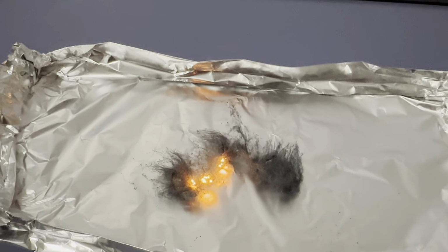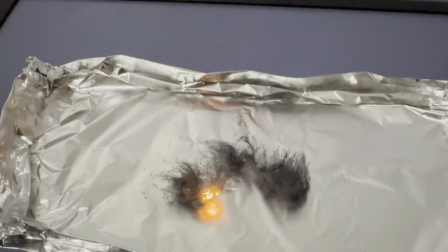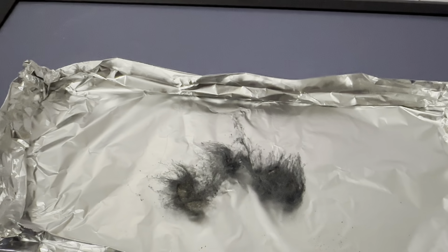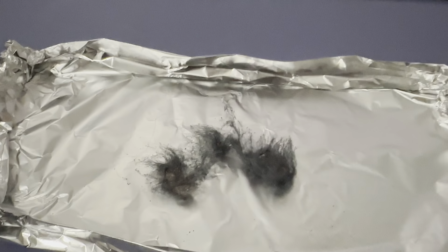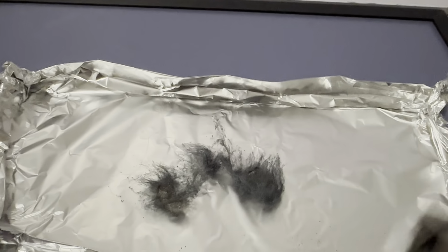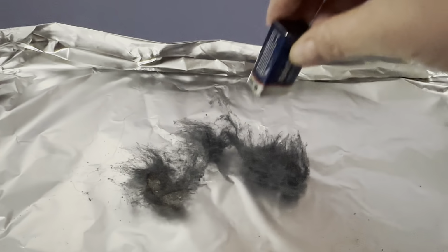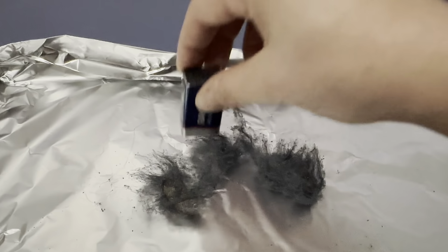And you'll see that it turned a different color. So we're going to let this reaction go, and then we're going to examine it. We want to make sure that all the steel wool that we have weighed reacts. Remember, you're going to need to weigh your steel wool before this happens. You're going to need to react all of it. So if I'm looking at it, you can clearly tell what's reacted because there has been a color change. You can also try, if you need to, touching the battery to it.